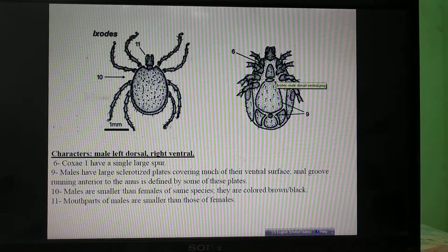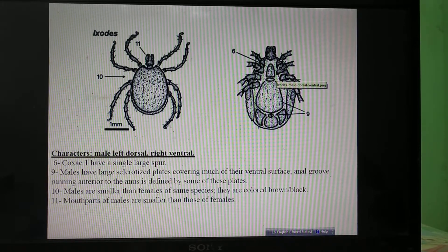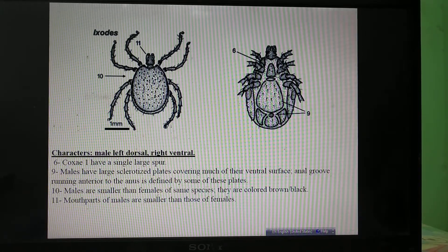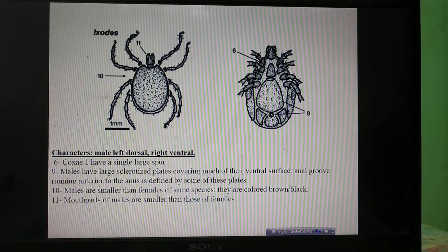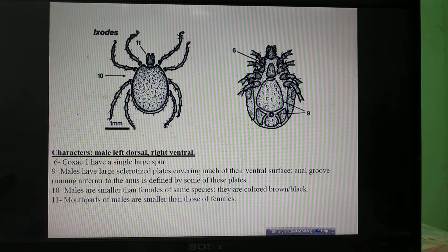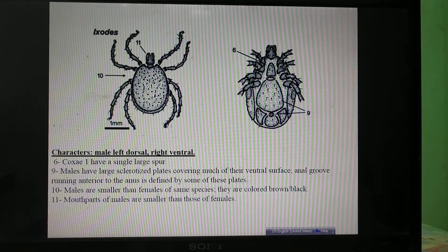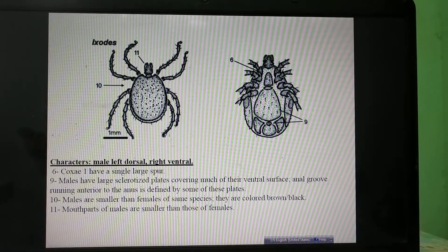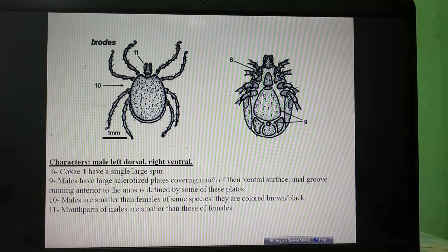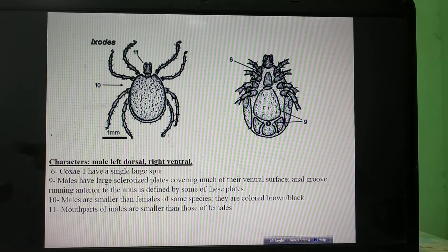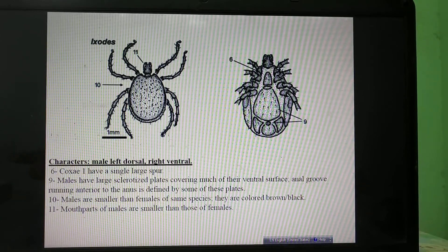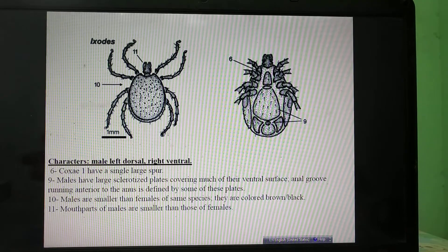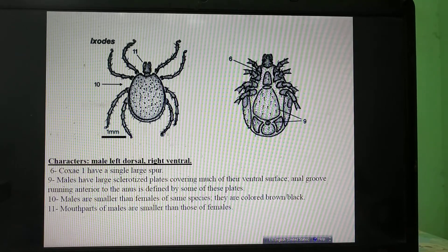With this we complete the identification of ticks at the generic level. Two other genera have been left out: Margaropus and Aponomma. For the characteristics of these ticks you can look into the identification keys. I will be posting material related to tick identification later on if required.